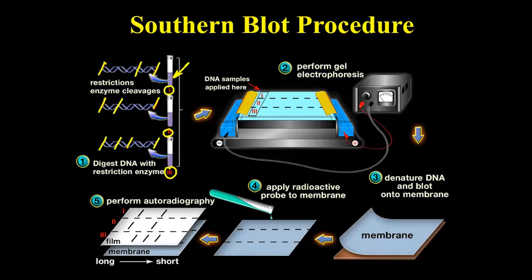and after you have the cleavage, in these tubes are going to be floating around fragments of whatever size. Now we're going to keep them separate and separate them on a gel, do gel electrophoresis so that the smaller fragments will travel farther, but basically we're separating out these fragments. Denature the DNA, because the probe is going to need to bind because of the complementary nature. Put it onto the membrane, and then we apply our radioactive probe to the membrane.